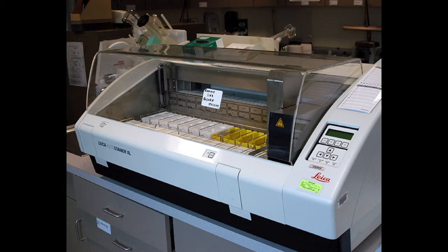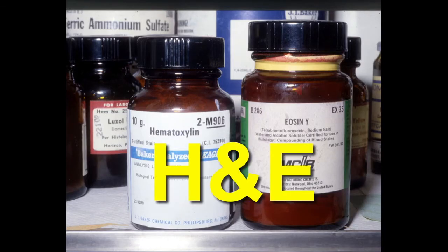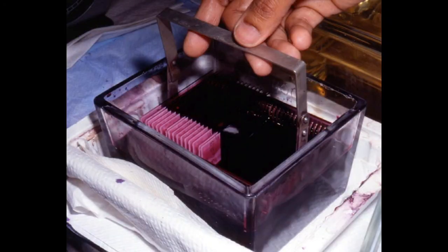In our laboratory, we have an automatic staining machine. And the classic stain that we use in pathology is H&E, or hematoxylin and eosin. Hematoxylin is a natural stain derived from a tree called logwood. It sort of looks like red wine.